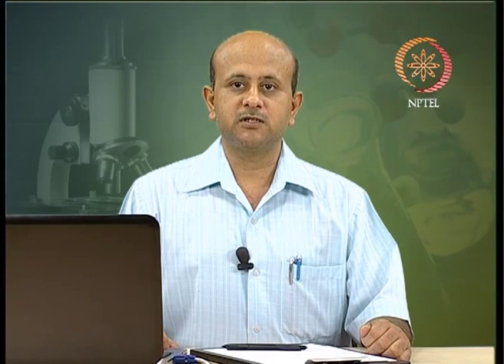In the previous lecture, we discussed the general overview and the basic principle of the centrifugation technique. If you recall, we discussed the various factors involved in the centrifugation of a particular particle.